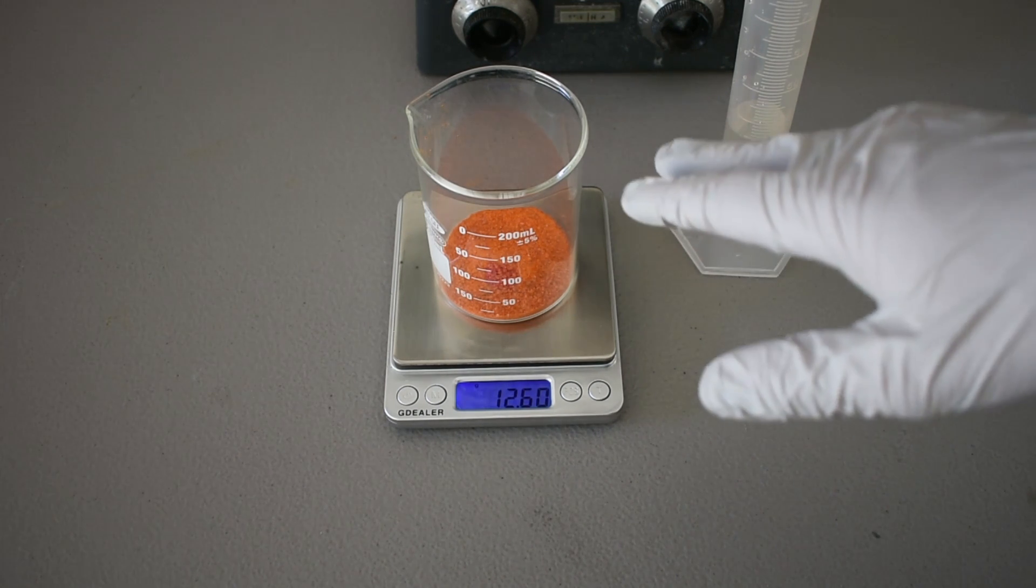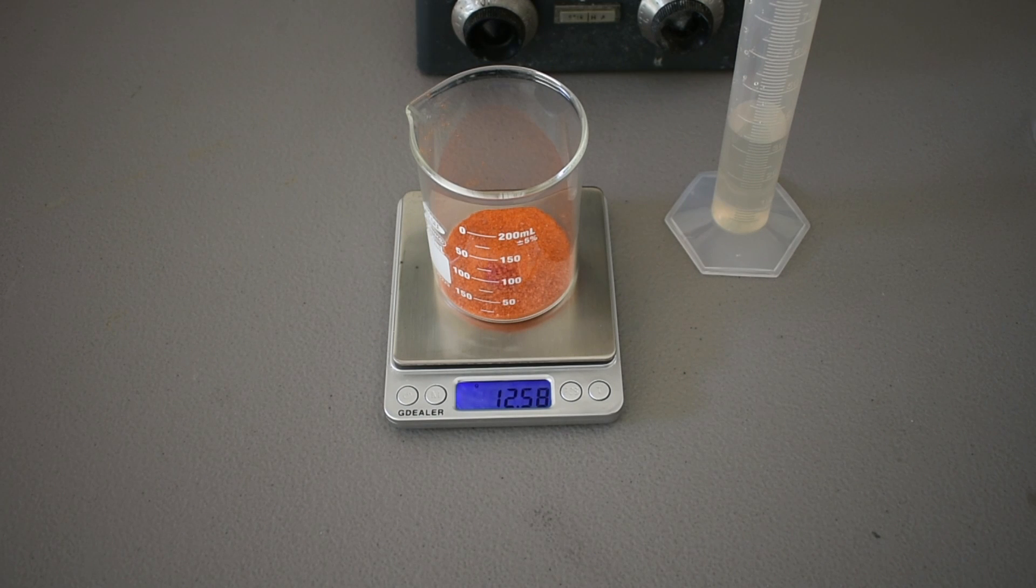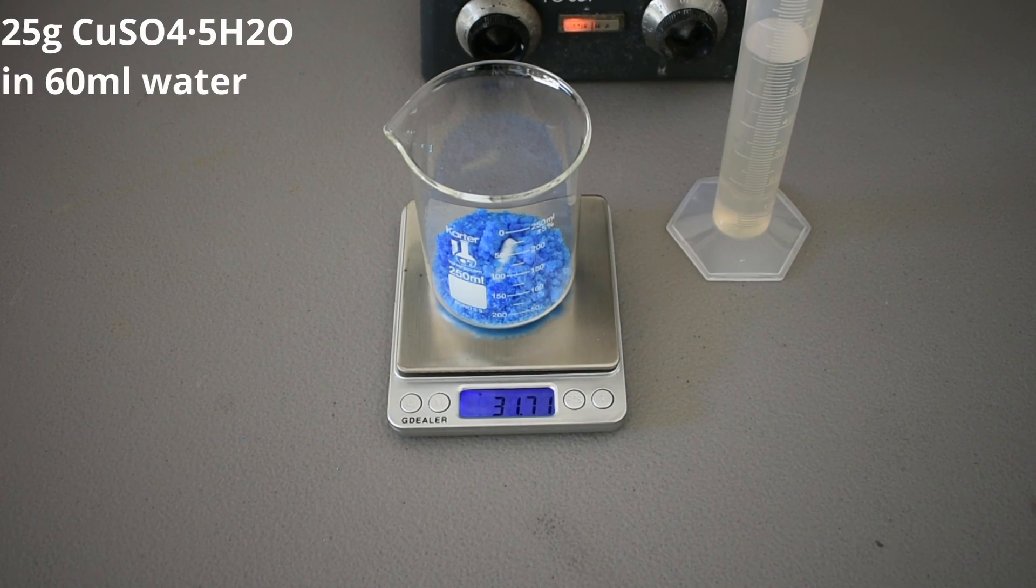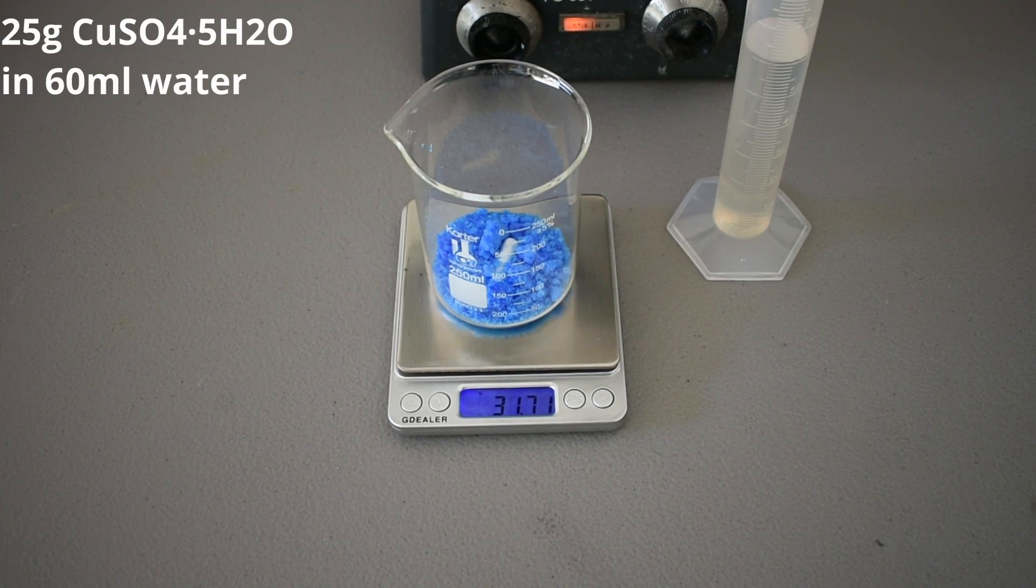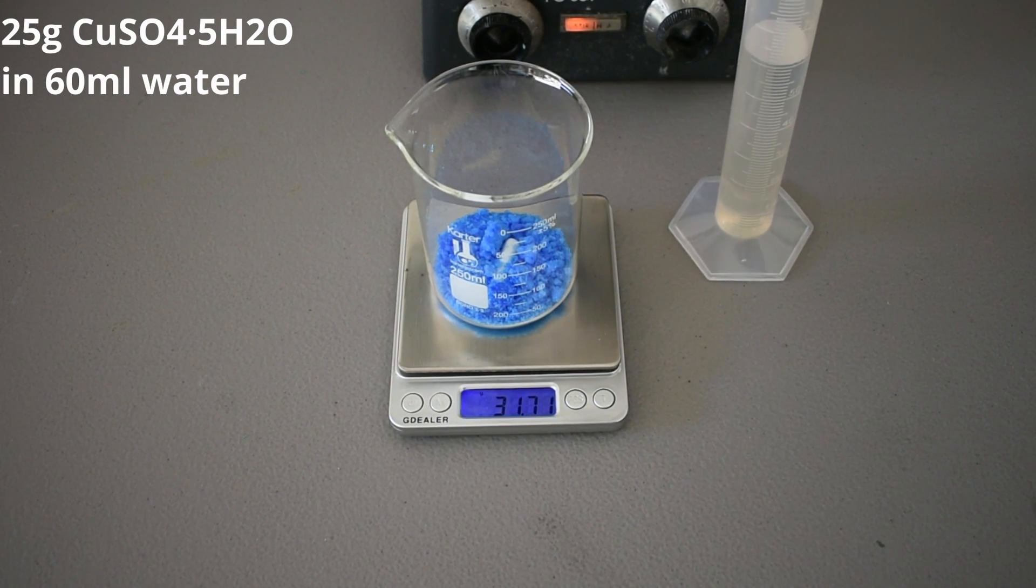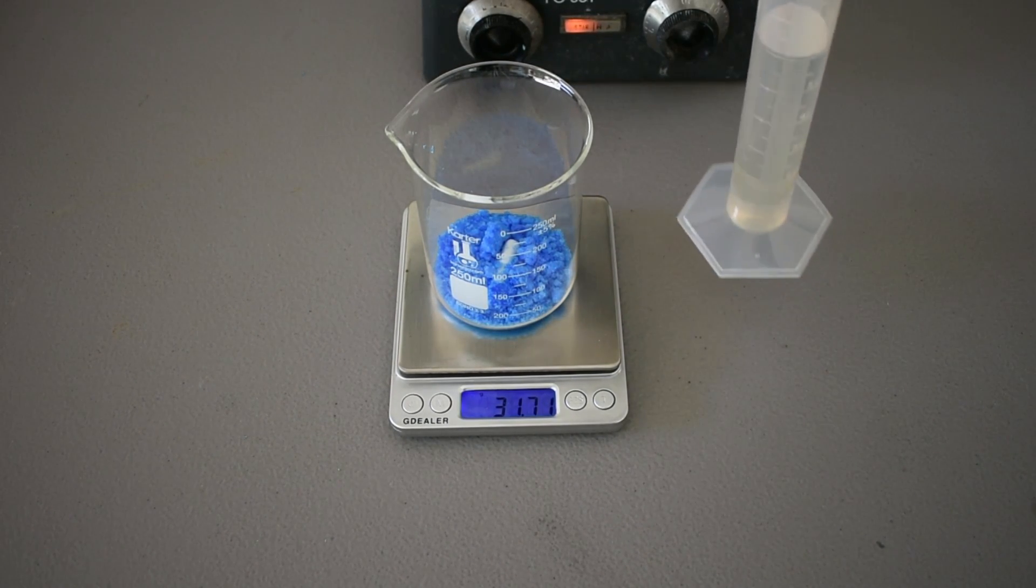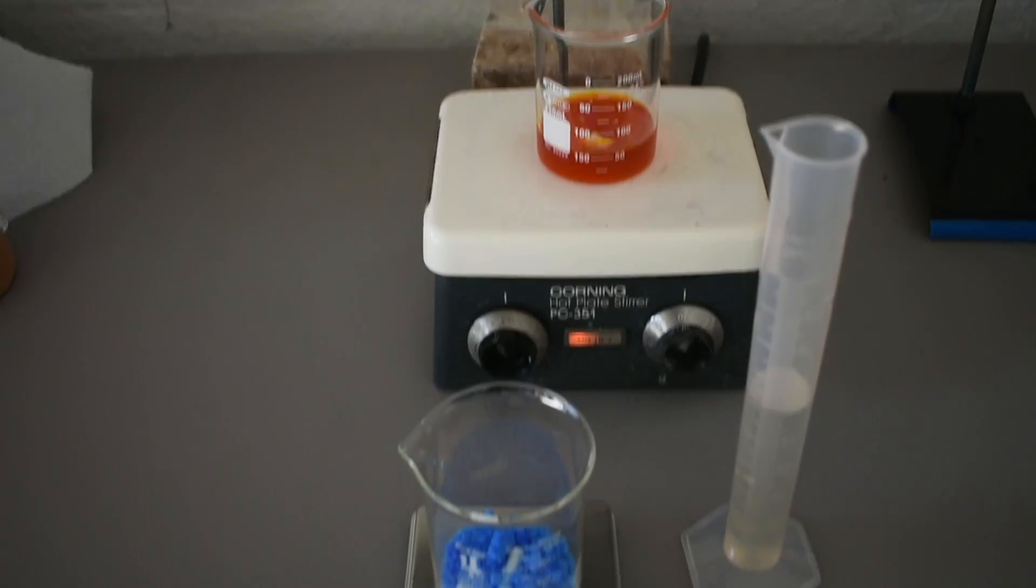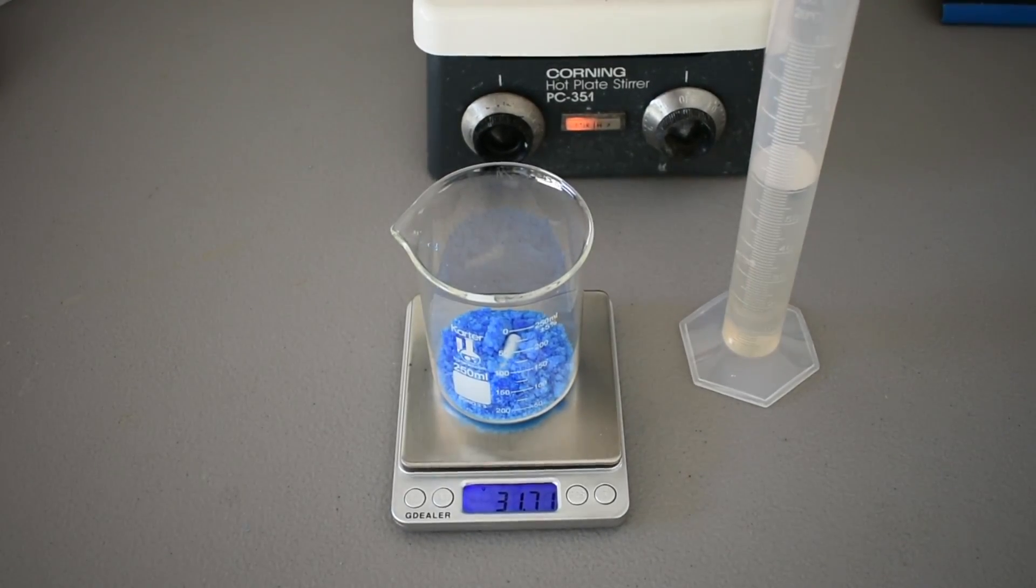So I'm going to mix up this solution, and then we're going to weigh out our copper sulfate solution and proceed from there. I've weighed out my 25 grams of copper sulfate. It says 31 because I already put the stir bar in, and then we're going to dissolve that in 60 milliliters of water. And I have the dichromate solution on the stir plate right now, and I'll come back when they're both fully dissolved.